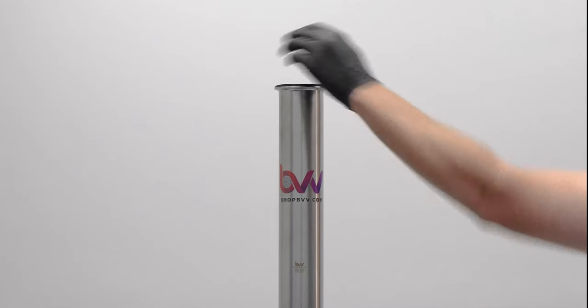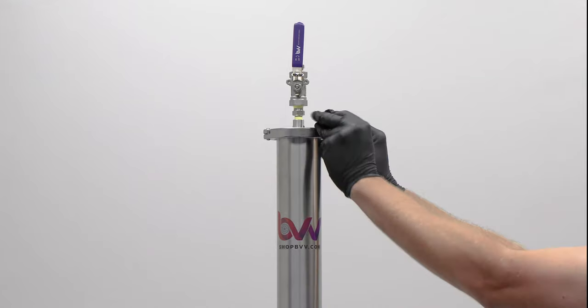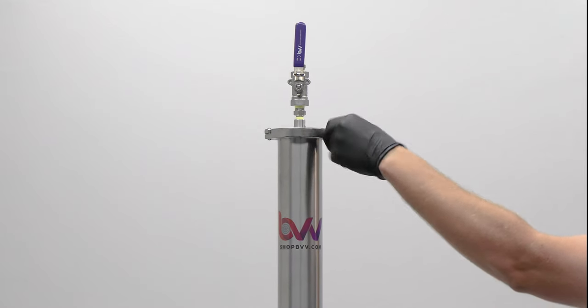Place the top cap on top of the extractor column and secure with a single pin clamp. Next, take out both of your stainless steel braided hoses.